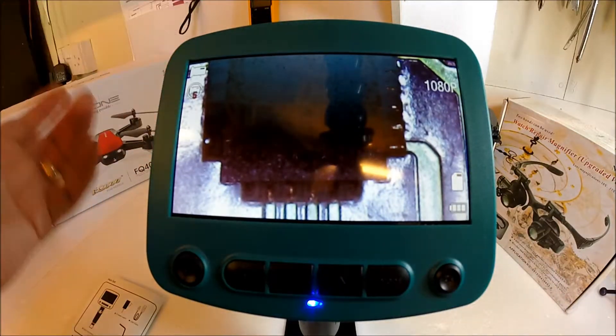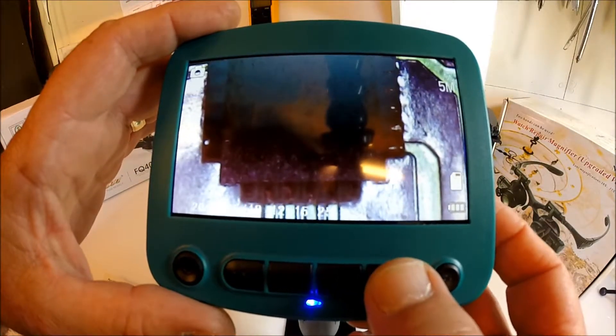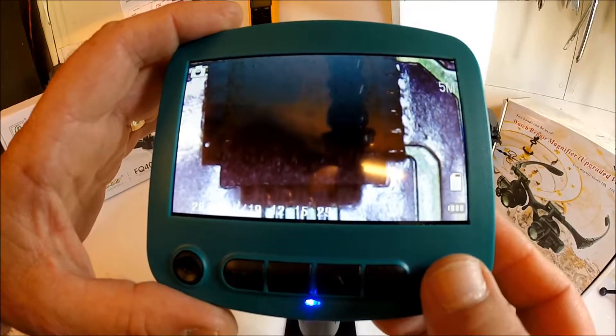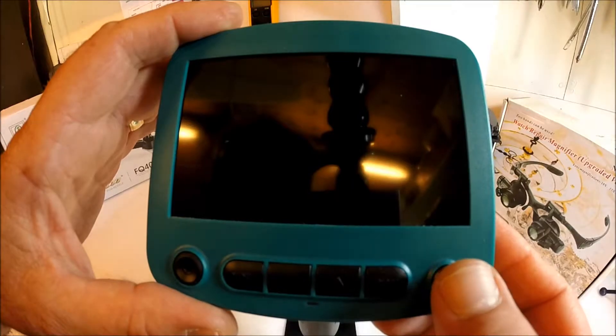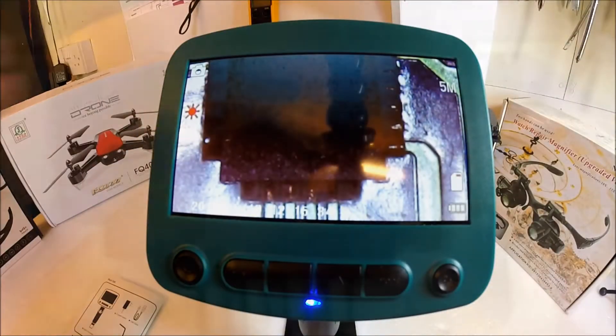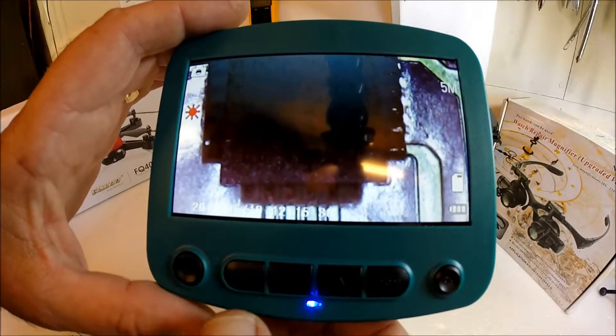At the moment we're in video mode. I'm going to take a photograph. And there we go — just taking a little photograph there.